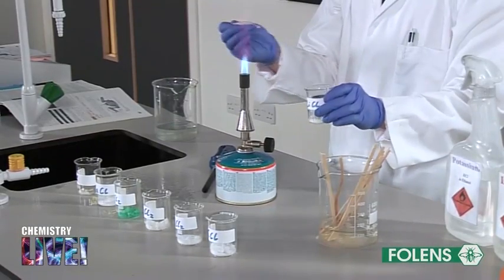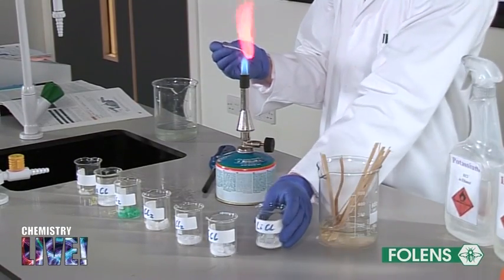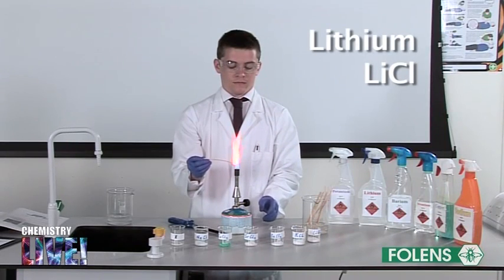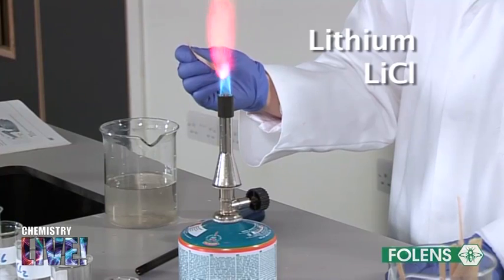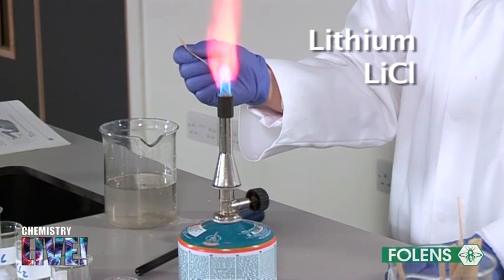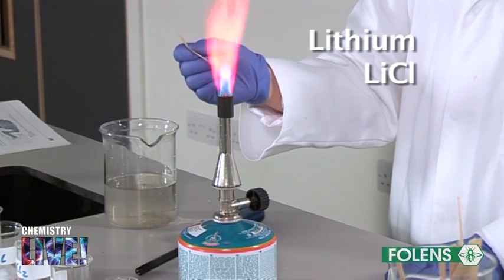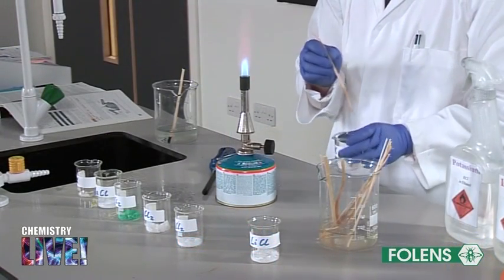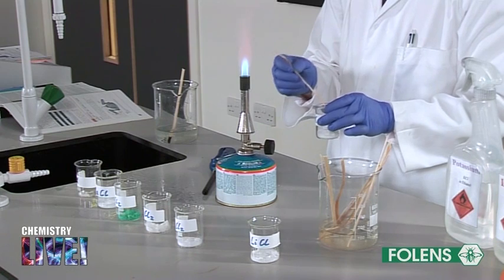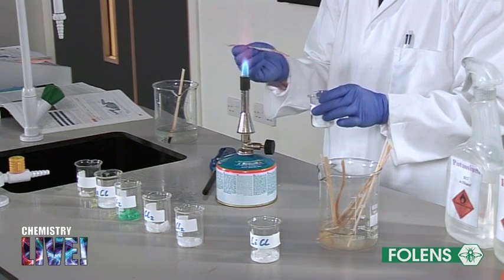We see that some of the lithium salt sticks to the wooden splint. Hold the wooden splint in the flame of the Bunsen burner and note the color given off as the salt burns. This color of lithium is often described as crimson. We repeat this experiment with the other salts in our list.